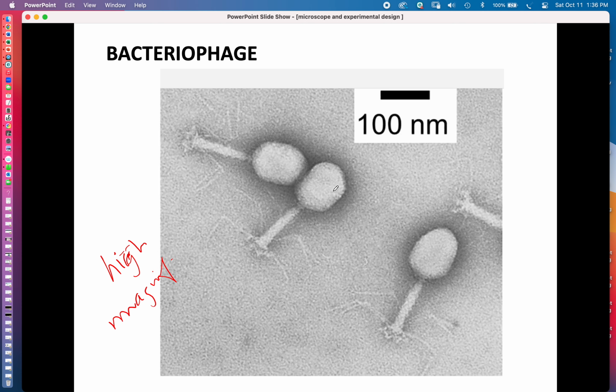These are bacteriophage, so that's one right there. That's a bacteriophage, and they infect bacteria. So these are viruses that are extra super tiny, and you wouldn't even be able to see them. Look at this though, because this is the case for this type of bacteriophage. It has a head, and that's where the DNA is that's going to get injected into the infected cell. Then here's the infected cell membrane, and this virus is going to land. It looks a little bit like a spaceship with legs.